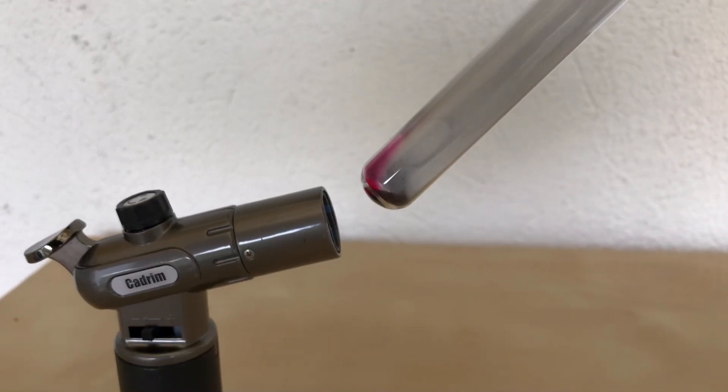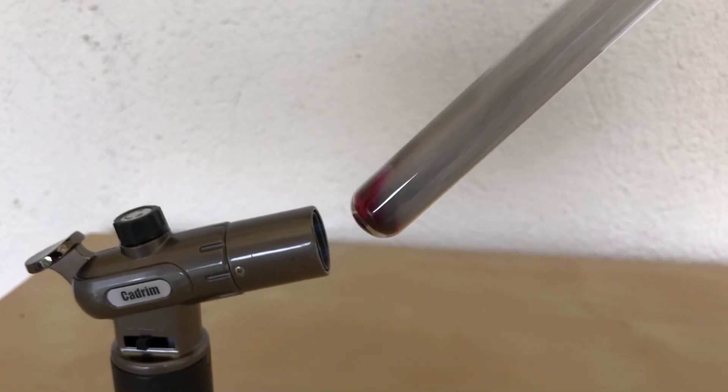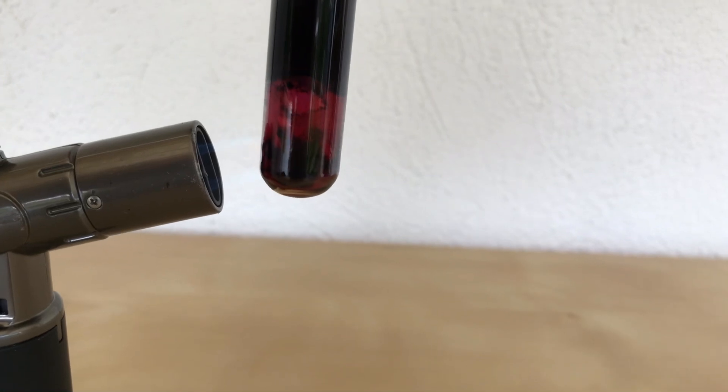When you look closely, you can see a hint of purple right here. Once the test tube was being heated up from a different angle, it became even more obvious. This reddish-purple vapor appeared.